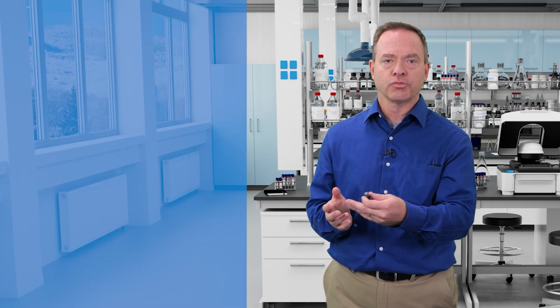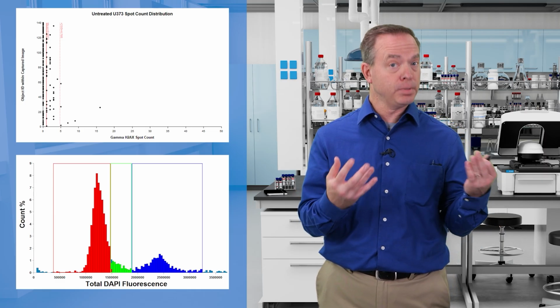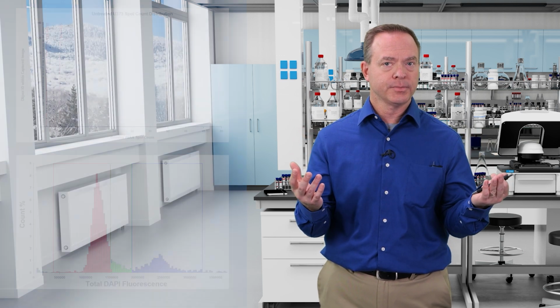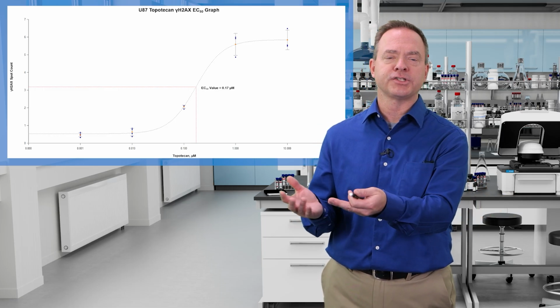Subpopulations can also be generated via visualization or via statistical analysis through the use of scatter plots or histograms. Once you've generated quantitative data from your images or plate read, you can generate experiment-level readouts. For example, creating a dose-response curve based on gamma H2AX foci, or normalizing your luminescence plate read to cell count. For an even greater assessment of experimental images, Gen5 offers 3 advanced analysis modules and a software overlay.